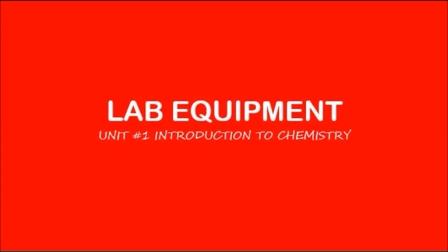Hey guys, my name is Sharice and welcome to Simple Chemistry. In this video we're going to be looking at lab equipment. I might not be mentioning all the lab equipment that you use in your lab, obviously that goes by case by case basis, but I'm just going to go ahead and go through all these pieces of lab equipment so that you have a better understanding of what their name is and what their use is.